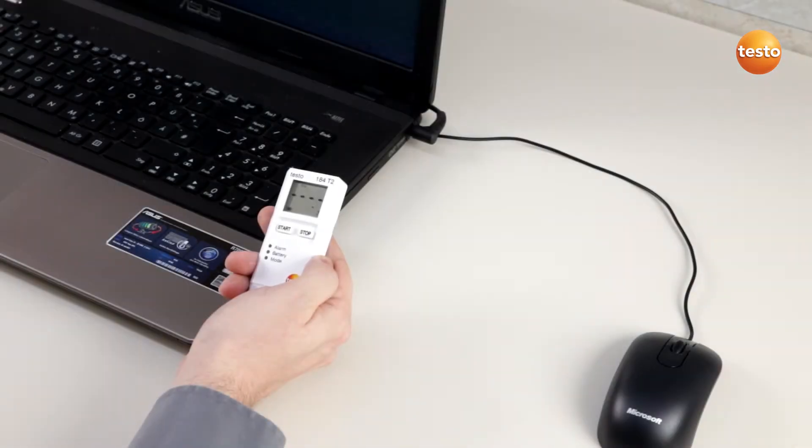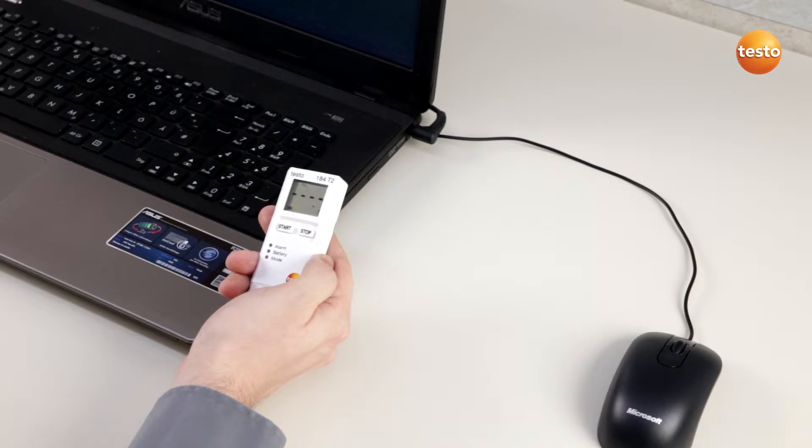Today we want to take a look at how easy and quick it is to configure a Testo 184 data logger.